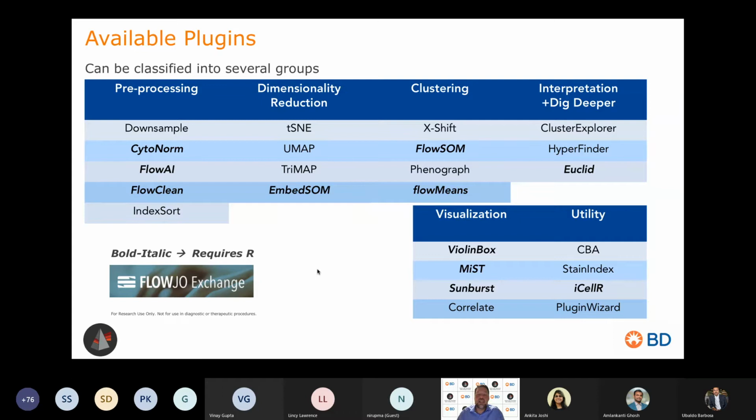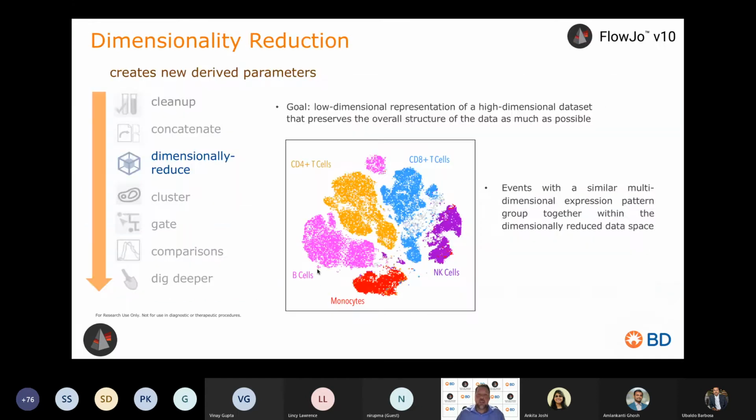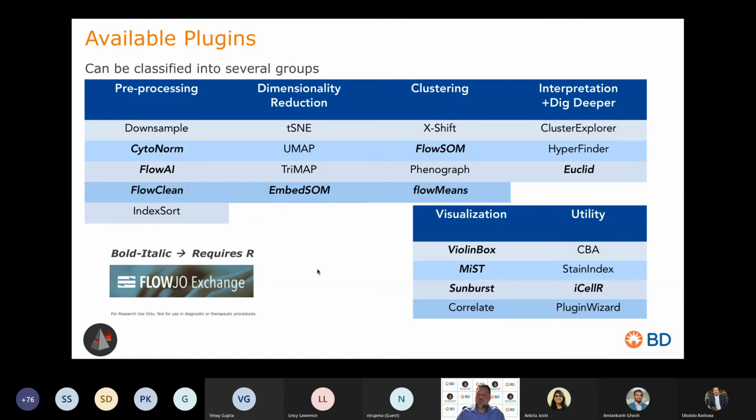So the data that we're giving you is an example data set with 5 patient samples just to get the workflow down and be able to concatenate, dimensionally reduce, and create cluster populations, and then visualize those clusters within the dimensionally reduced data space. I don't believe it's really fruitful to go and try every single method the first time you go. Just pick one.